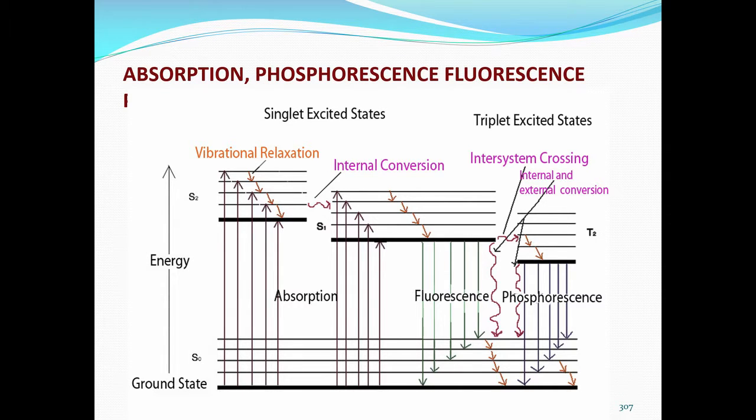fundamentals of the absorption phenomenon. Whenever energy is supplied to the molecule in a spectrophotometer, the electrons absorb the radiation and go to the next higher energy level.